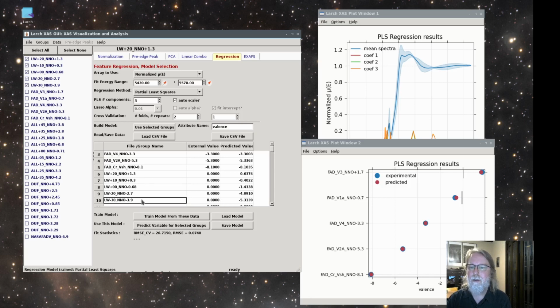These are all log units, so over several orders of magnitude in this value, and you get a value that's, say, with an accuracy of about plus or minus a half to plus or minus 1. So that's pretty good. That's useful, and it's very simple to do. We just took our training set, and we can apply that to predict the other variables.